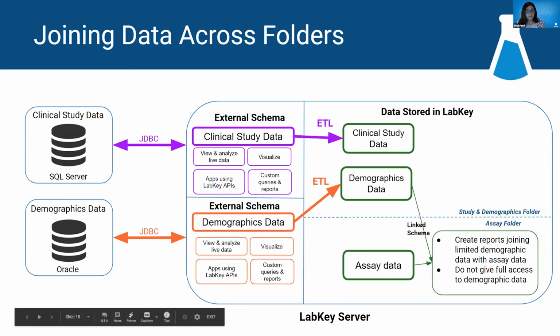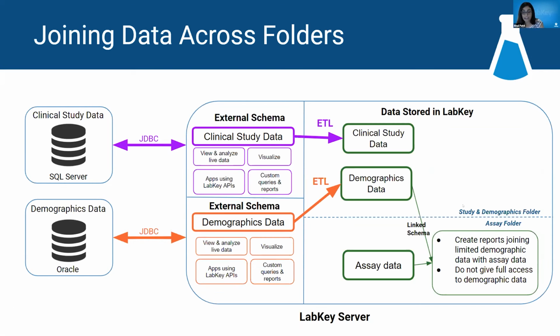One of LabKey's signature features, among many others, is our folder-based security model, where you can give read or write access to users or user groups in a given folder where the data resides.